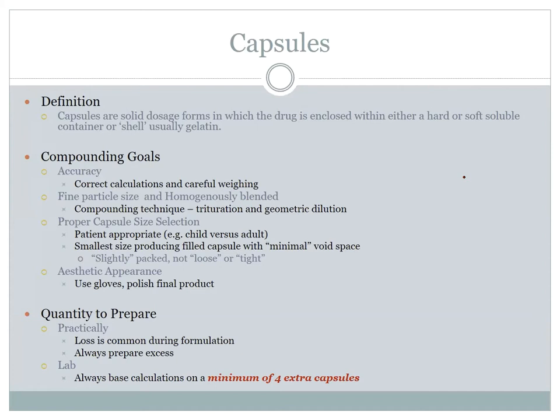They'll sometimes cut those and squish the liquid out under the tongue. Or benzonatate, the little round yellow roly-poly ones. Those have liquid encapsulated in gelatin, but it's a soft shell gelatin. They're much more difficult to do. You actually have to kind of inject the liquid in there, pull it out, and heat seal the capsule so it doesn't leak. So those are more specialty. What we are going to do are powders, encapsulated. So we're going to put those in the hard shell gelatin capsules.